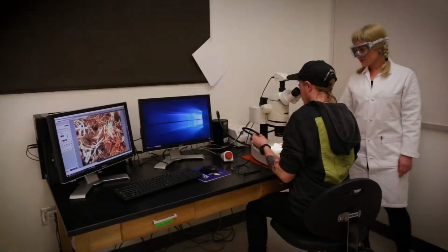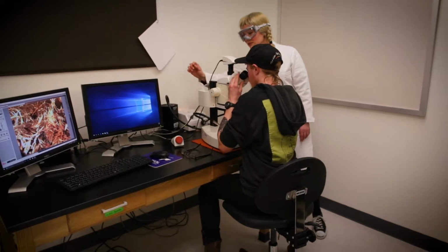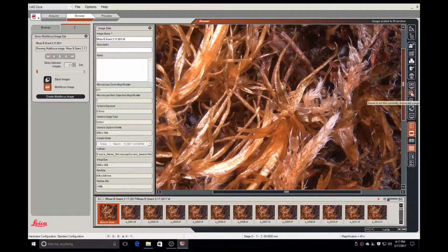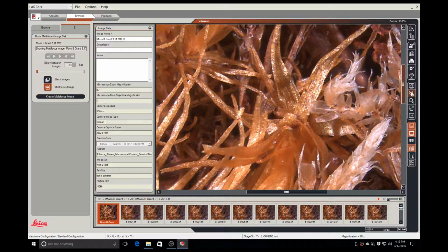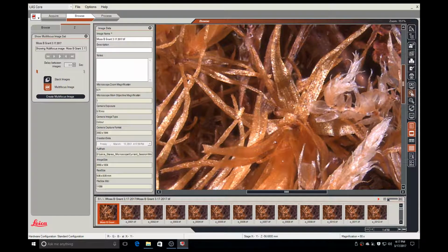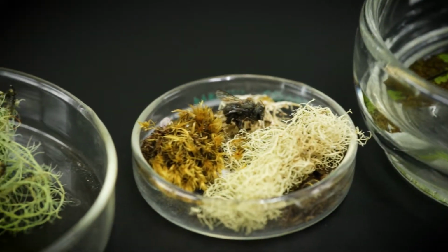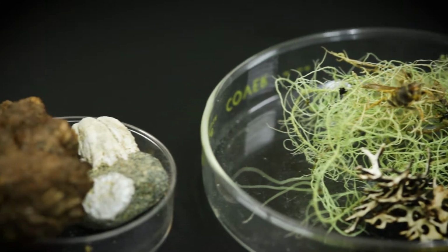This video is an introduction to acquiring focus stacked images on the Advanced Stereo Microscope. Focus, or Z-stacking, is a technique that combines multiple images of the same object taken at different focus distances. The final image has a greater depth of field than possible with normal imaging equipment. This method is commonly used to produce photos of insects, plants, and minerals.